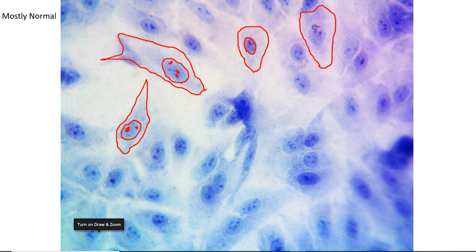Here's another one that I'm drawing on to show you another example. Here is the membrane, the nucleus, and then the nucleoli. So if we were to look at this particular one and measure the body diameter, we would be looking at this entire length, all this fuzzy stuff. That's the cytoplasm, the membrane. If we were looking at nuclear diameter, I would be looking inside at this nuclear membrane, and that would be my nuclear diameter. So that's how you would differentiate between those two.